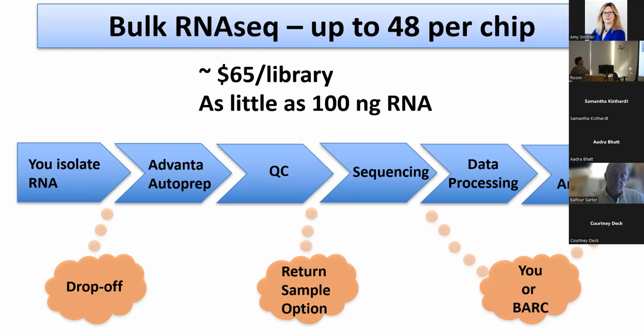And so during the consultation step for your project, if you do not have analytic expertise in your lab, we will hook you up with somebody through the BARC that will handle your data for you. And they work very close with us, the core, to understand what your experiment is, what your design is, what your goals are, all of those things. So that by the time the data come from our core and we pass it off to them, they've already had an idea, and you've then probably already worked with them to decide what are the deliverables that you want, what are the visualizations you want.